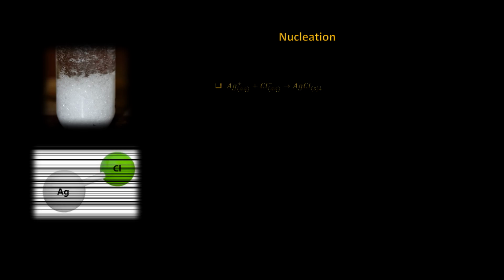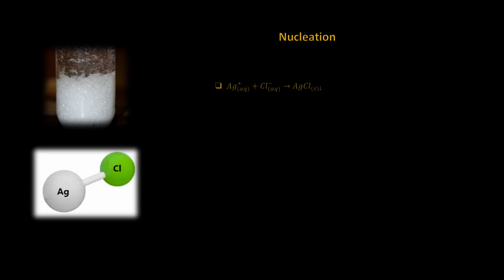Before any precipitation can form, a supersaturated solution of the counter-ion must be prepared. In the example with silver nitrate in solution, the counter-ion for the positive silver ion would be chlorine, which is negative. The nitrate is in solution along with the chlorine, both existing as atoms floating around in a solution of water. Now, solubility rules state that silver will precipitate, as it is not soluble in a solution containing chlorine.